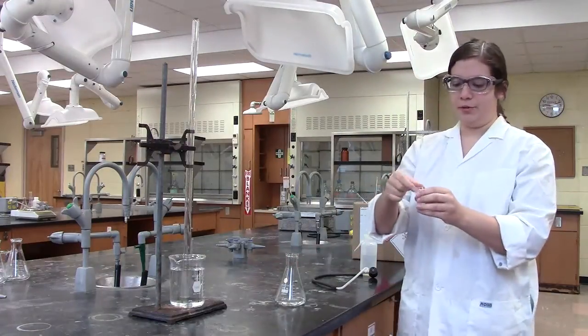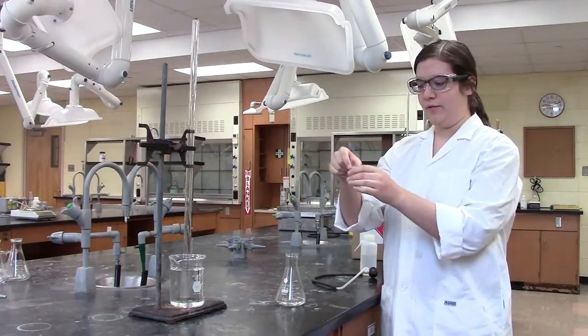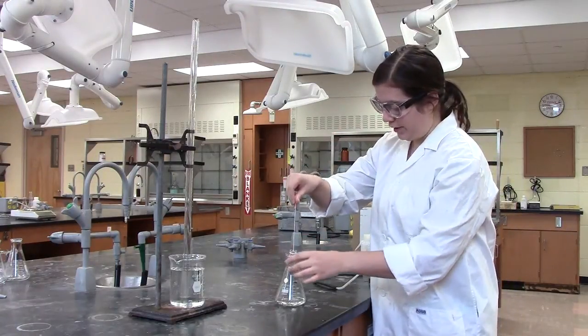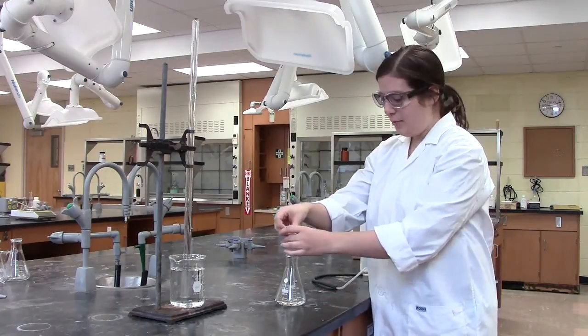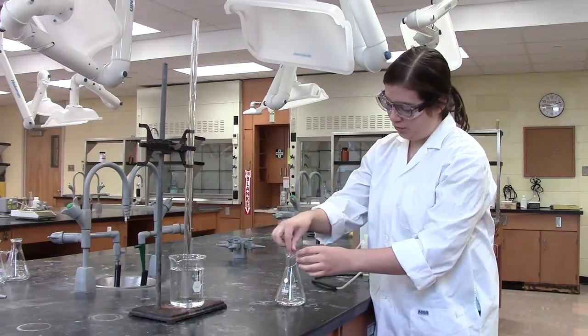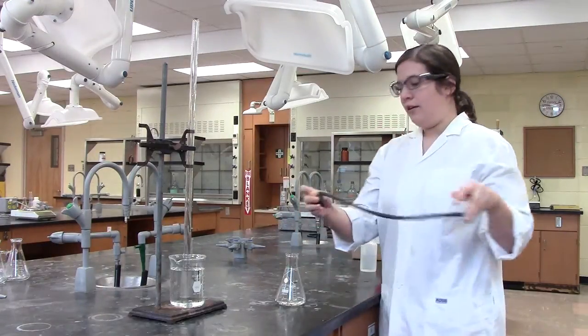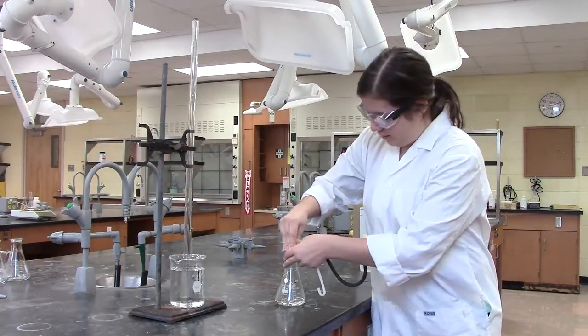In order to mix your solutions, you're going to have one solution in an Erlenmeyer flask and your other solution in one of these little sample vials with a string attached. You use the string to lower it very gently into the Erlenmeyer flask and make sure it's standing up. And then you want to drop the string completely into the Erlenmeyer flask. You can then take the stopper and make sure that it's stoppered very tightly.